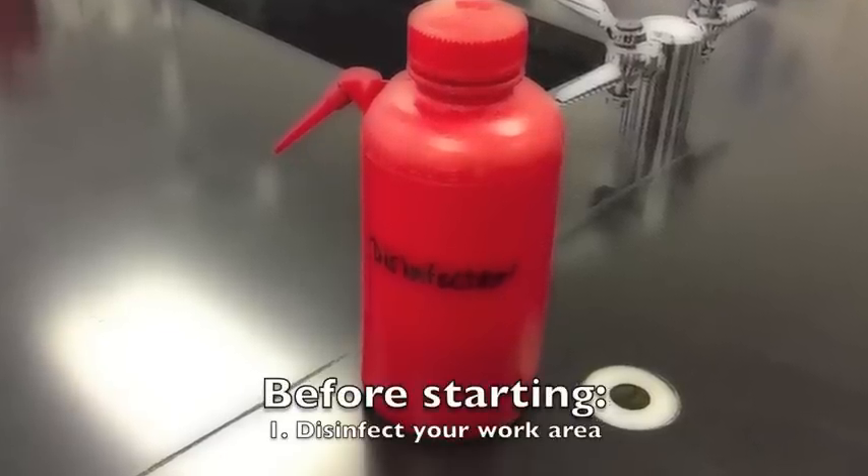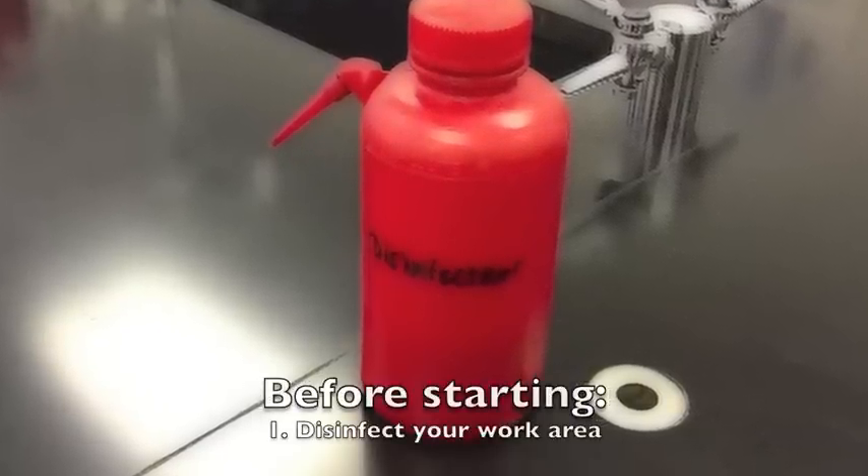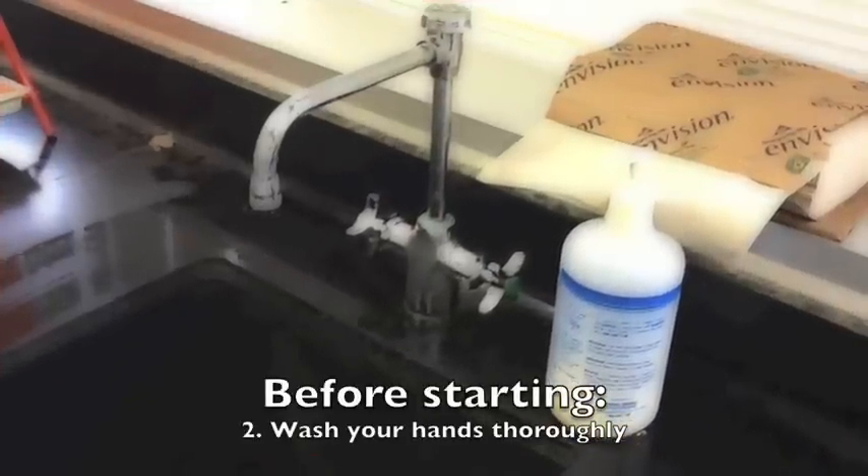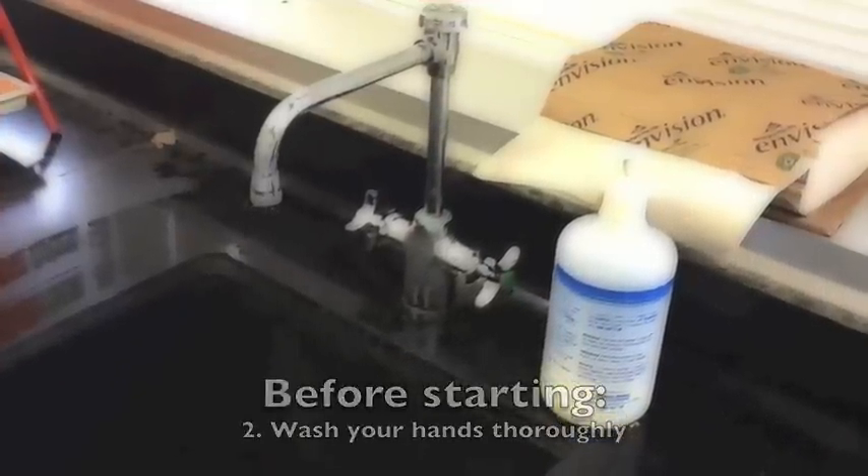Before starting your aseptic transfer, you should disinfect your work area. You should also wash your hands. If needed, a lab coat and gloves may also be worn.